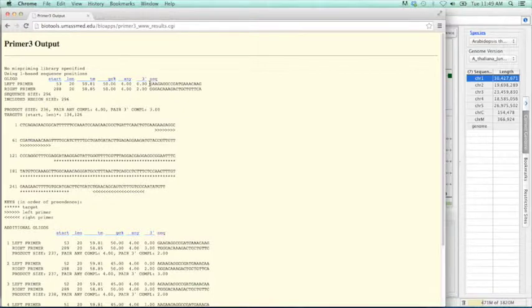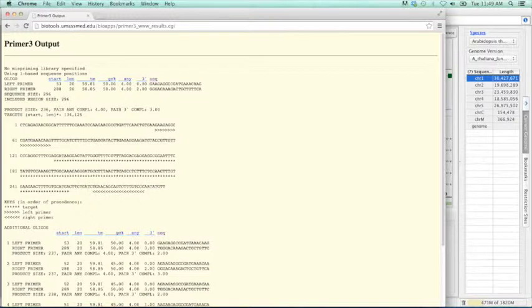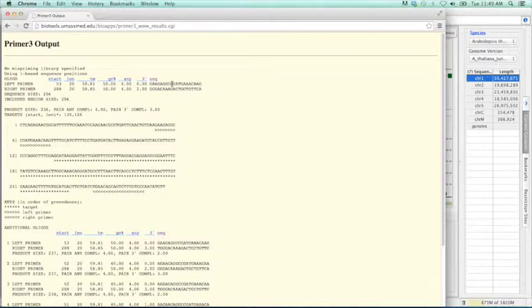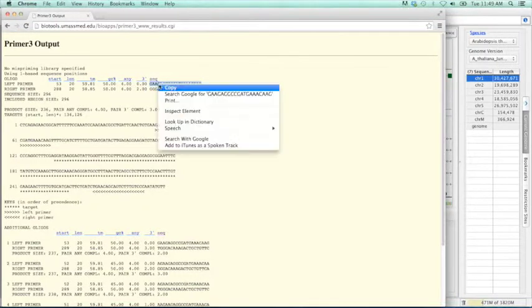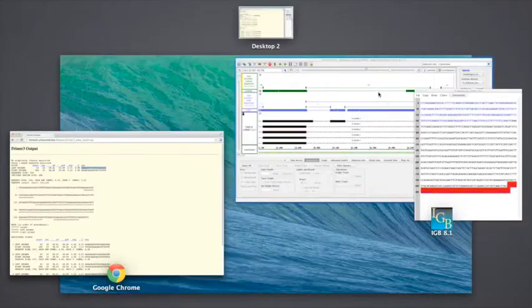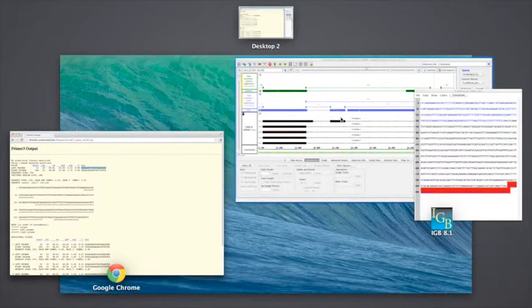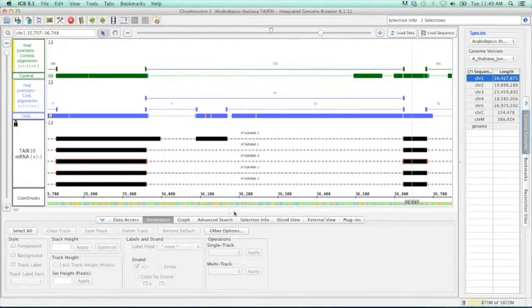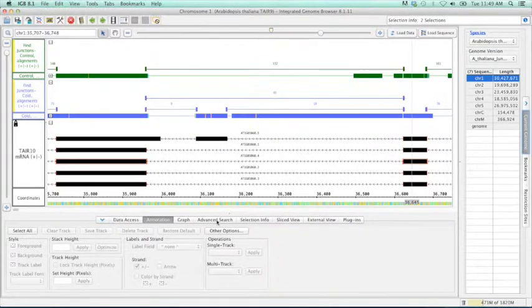As good as this is, what we really want to be able to see is kind of a visual analysis of where those primers are, how they fit into our analysis of alternative splicing, make sure they're facing in the right direction. So what we want to do is I'm going to select this first primer. I'm going to Copy. And let's jump back into IGBI.